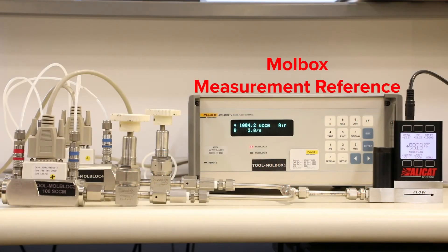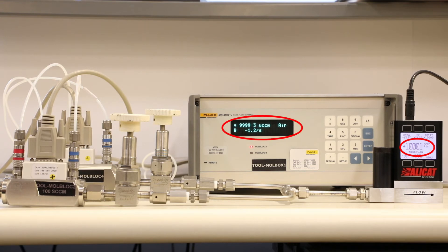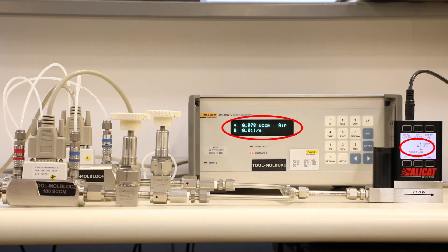New electronics in all of our instruments give you more flow control with a 10,000 to 1 control resolution and accuracy down to 0.1% of full-scale flow.